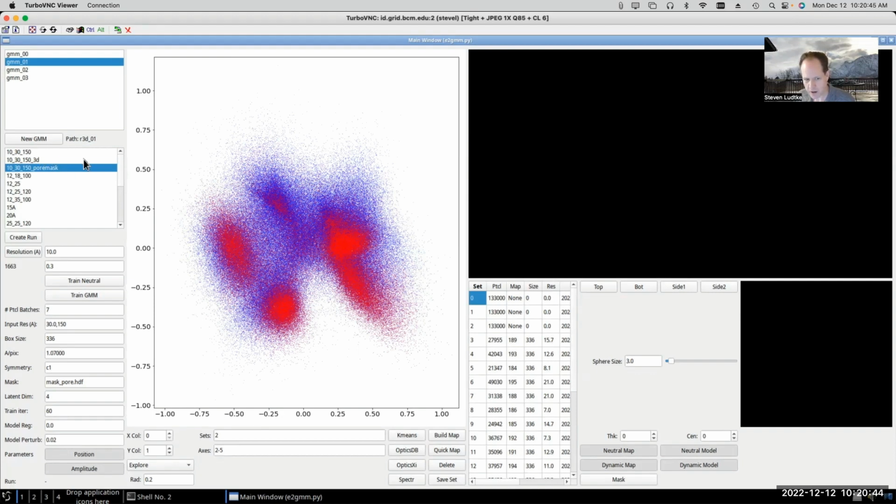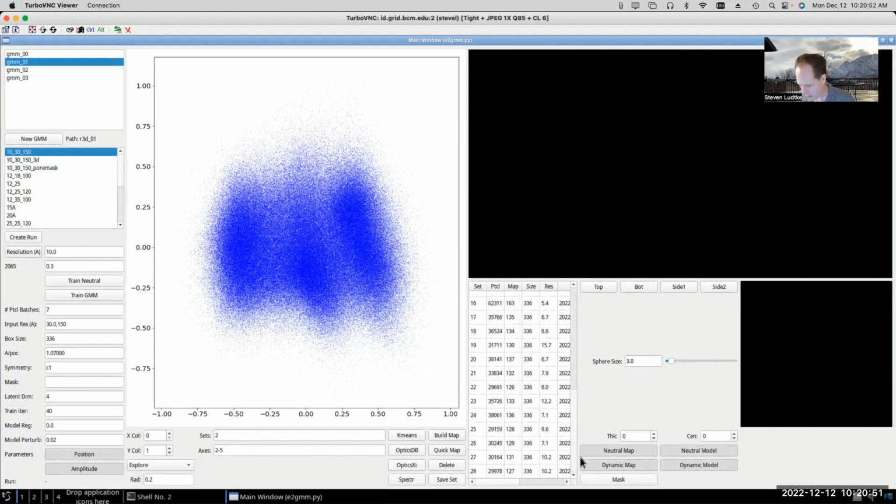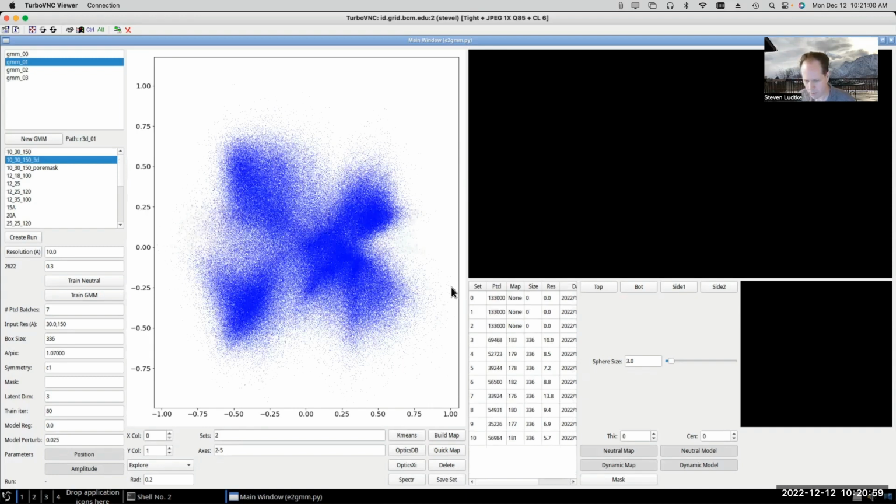Now, if I go back and look at the other one here, I also had, maybe I don't have the 3. Hang on, maybe I have to pick a different one. Somewhere in here, I also have the 130. Yeah, here we go, like this one. So here, the 130, there was no mask in this one. But again, we can then see the representation.